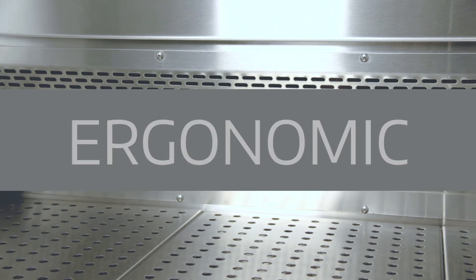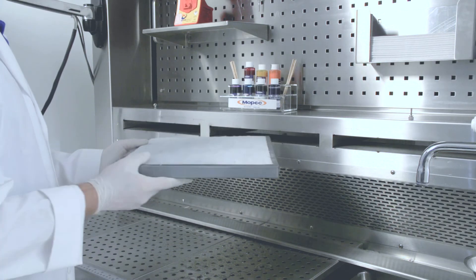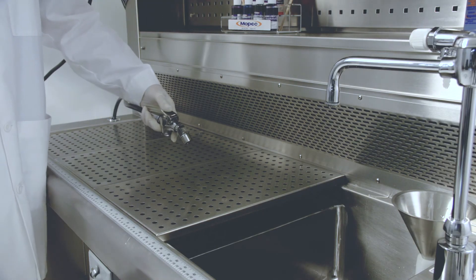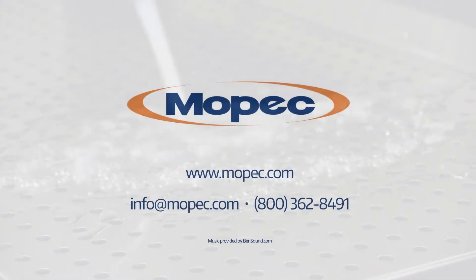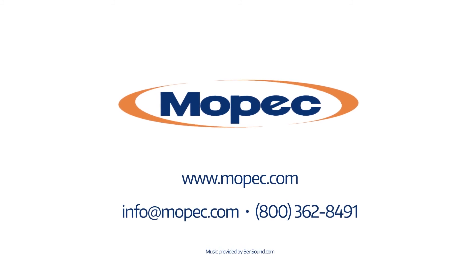Safe, ergonomic, customizable, these are the hallmarks of all Mopec products. And with the Mopec MB-800 grossing workstation, it all comes together. A tool to help the pathologist in revolutionary ways. Please call your Mopec sales representative to discuss this breakthrough and how it can help you.